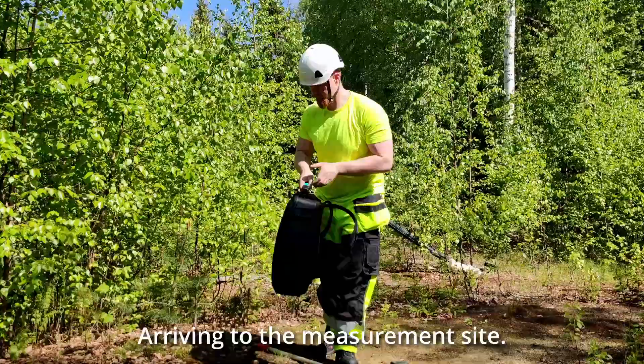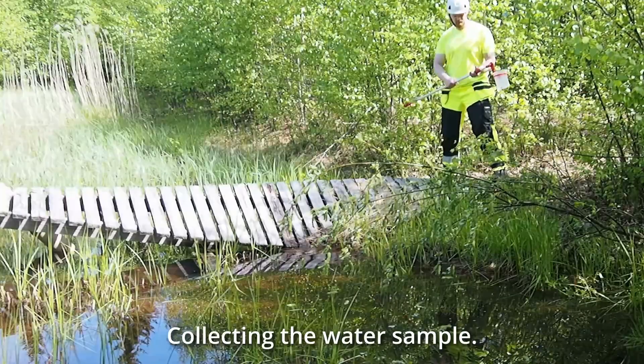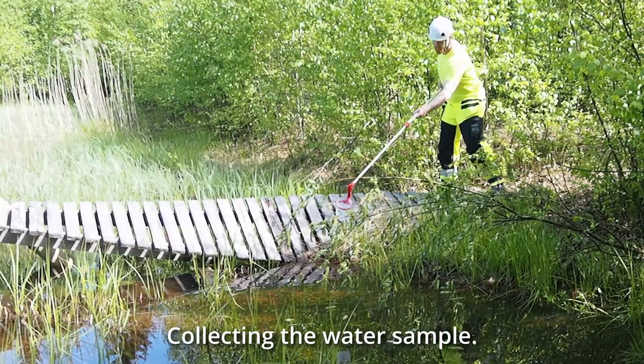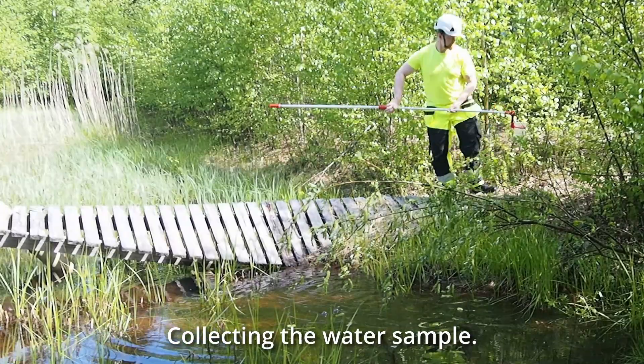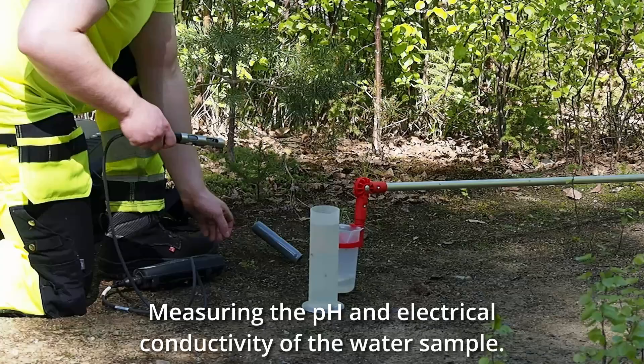Arriving to the measurement site. Collecting the water sample. Measuring the pH and electrical conductivity of the water sample.